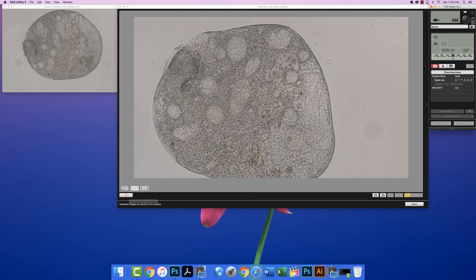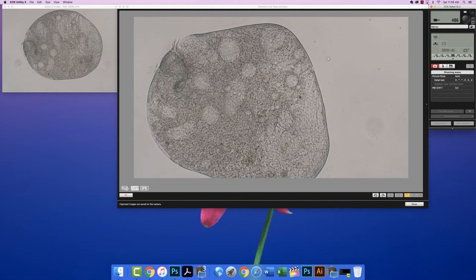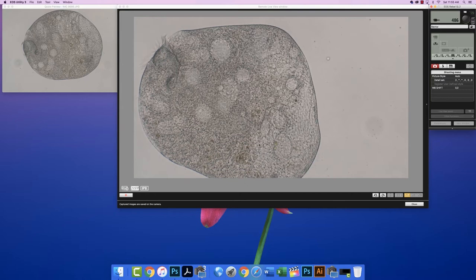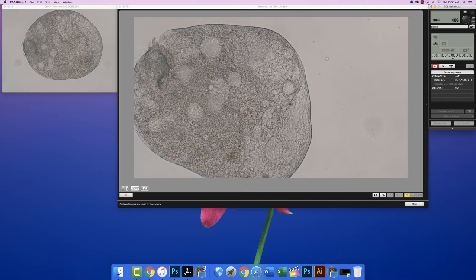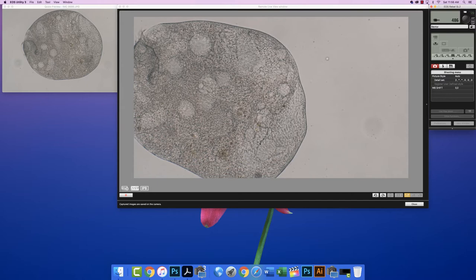I mentioned before that if you're taking a movie, you have to have an SD card in the camera. It's true that if we're just taking still images, we don't have to have a card in the camera, and we can just save the images to the folder on the desktop or to an external hard drive or thumb drive. All of those will work. But if you're taking a video, you need the card in the camera because the USB cable that connects the camera to the computer can't carry the information fast enough to record the video on the computer directly. You have to save it first to the card and then download the video to your computer.